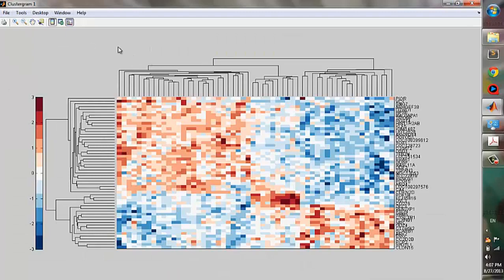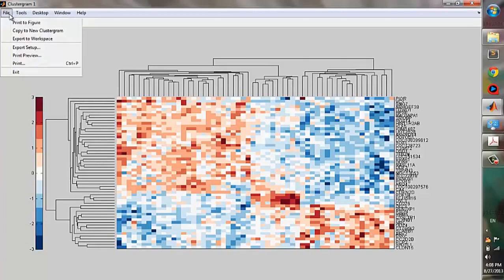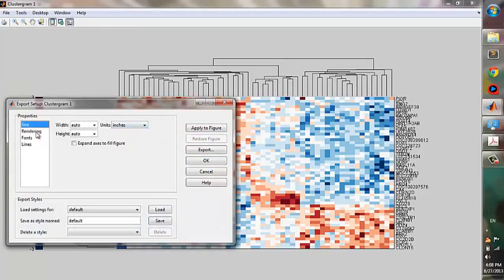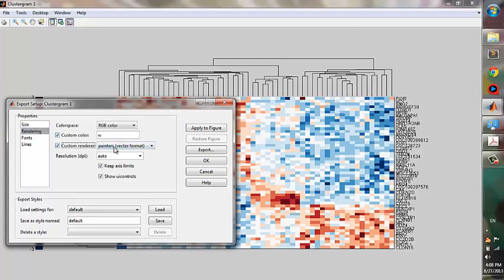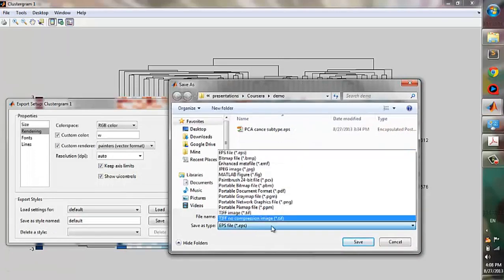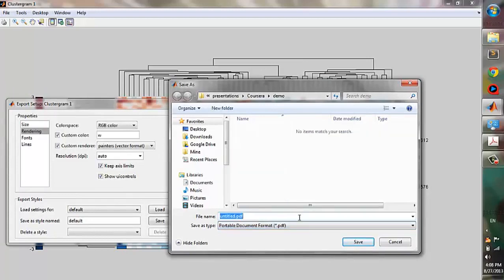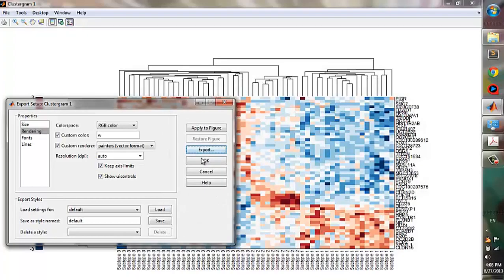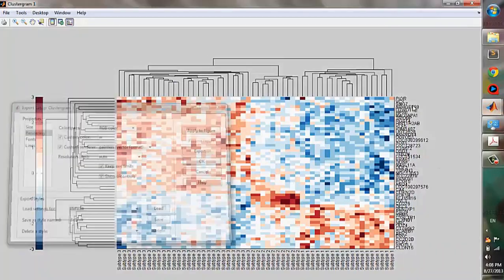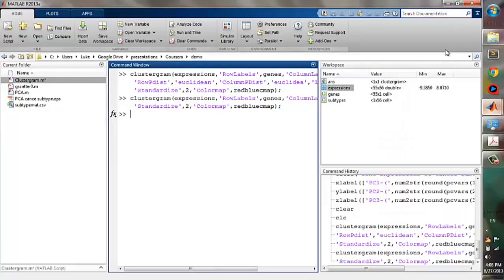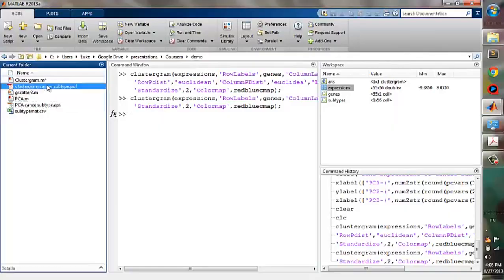Here, I will teach you a trick to export clustergram in vector format. First, click Export Setup, change rendering to Painter's vector format, and click Export. And choose the format as PDF. This is the key step. Using EPS won't work. I will give it a name as clustergram. In this export, I already resized the figure. But it's better not to resize it and just use the figure as it appears the first time.